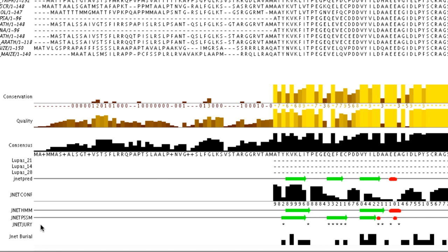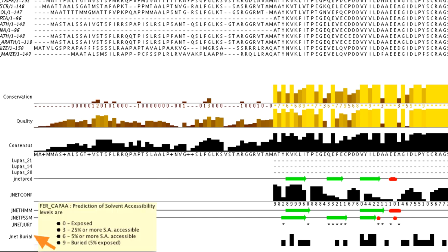The JNetJury annotation row marks where all profile prediction outputs disagree. Lupas21, Lupas14 and Lupas28 annotation rows predict the presence of coiled coils. The JNetBurial annotation predicts solvent accessibility levels.